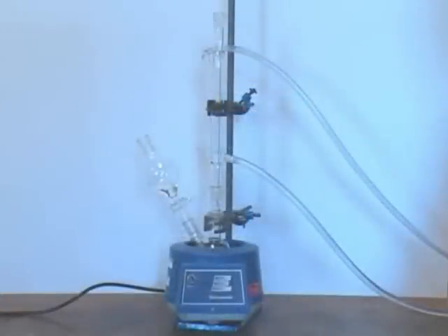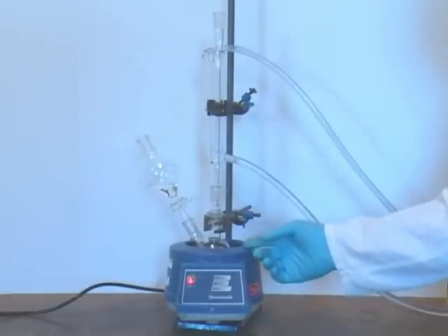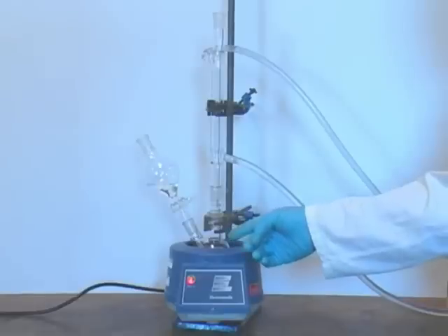And now we can fully assemble our apparatus. Here we have a heating mantle at the bottom. Alternatives include heating with a Bunsen burner, a steam bath, or either an oil bath or a heating block on a hot plate.